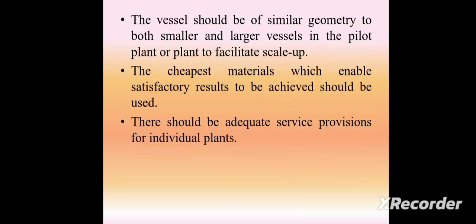The cheapest material which enables satisfactory results to be achieved should be used. There should be adequate service provisions for the individual plants.